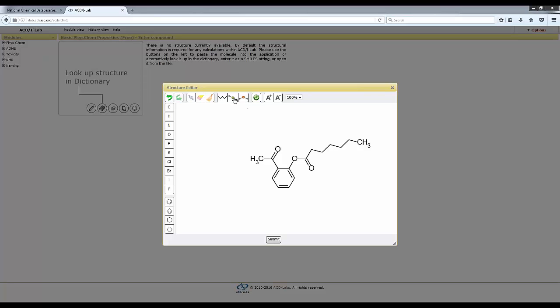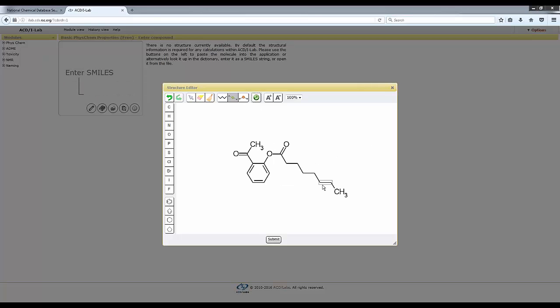And now there is also this tool here. So if you wanted to have, let's say, in between here another atom, you select here to add the node, you select the bond, click on the bond, and you get it. It is already here. If I go to clean the structure, you will see that there has been one more bond added. Maybe we'll see it better in another example. In the same sense, you can remove a node. So if I go here, it chops it off. Okay, so let's undo all these and go back to the simple molecule.